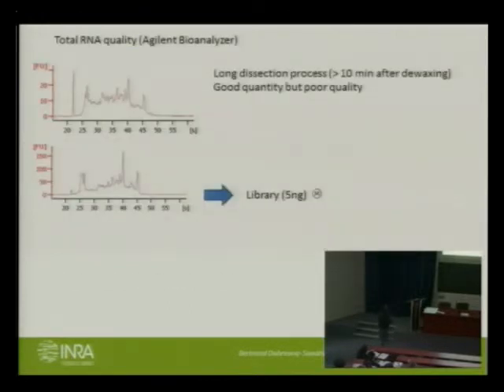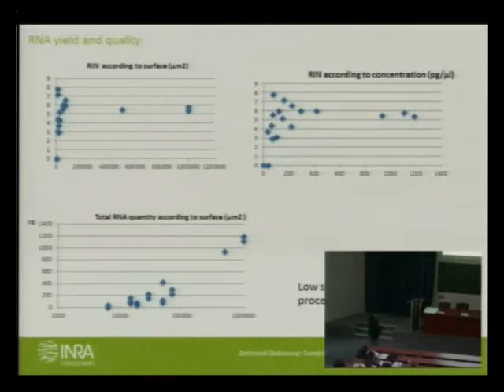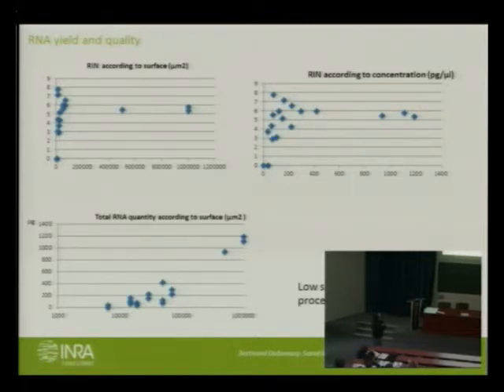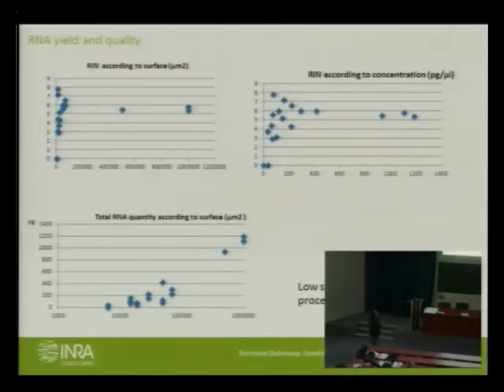On the quality point: when you leave your slides on the microscope for a long time, quality decreases — which is rather normal. We tried to perform a library with relatively low-quality RNA and we failed. We then addressed the quality issue and tested a few things. Regarding quality according to micro-dissected surface: to our great surprise, we have very high variability with low surface micro-dissected areas. Quality stabilizes after a certain quantity, and concentration increases according to surface. The key point is that low surface allows higher speed, but low surface also produces less RNA, so we need to decrease the quantity needed for RNA-seq experiments.